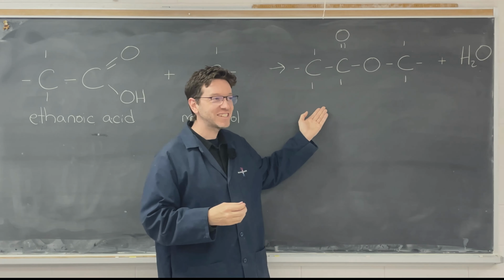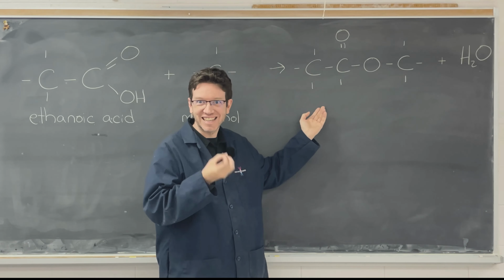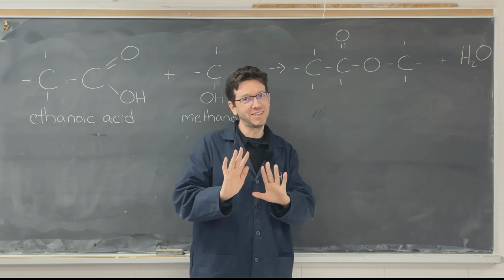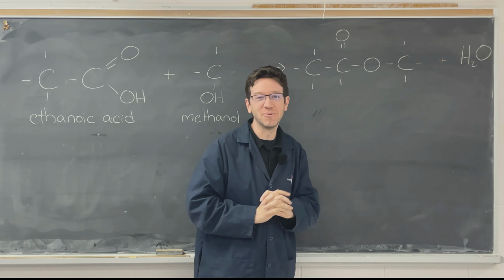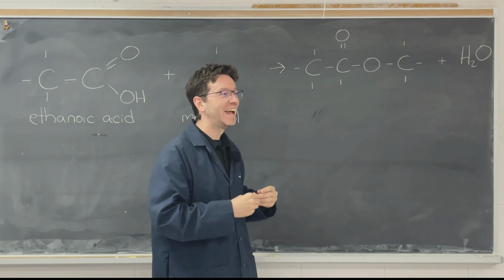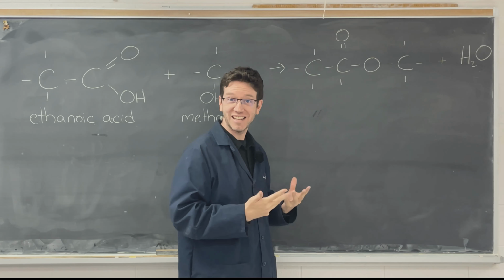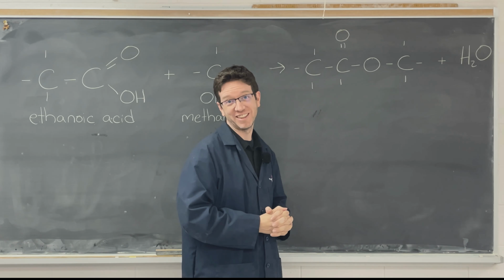Specifically, esters have a fragrance, a scent to them, and so we're going to be observing those scents. Well, on the video, I'm going to tell you what scents each alcohol makes, since you obviously can't smell it in a video. It's a very strong scent though, which is why I have students either love it or hate it.